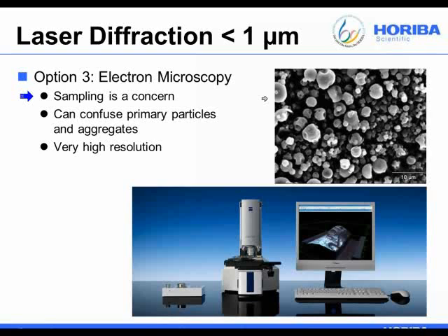So in the image here, we'd look and say, all right, we see a small particle that may be attached to this bigger particle, but it's hard to say for certain. Are they just sitting on top of each other? Or have you decorated the larger particle with the smaller one? Are these actually joined together and can be considered the primary particle, or is it just a dispersion issue? It is, however, extremely high resolution. As you can tell, you're actually imaging the particle surface. There is no distribution broadening happening because of some scattering effects. It's a very nice solution if you have it.